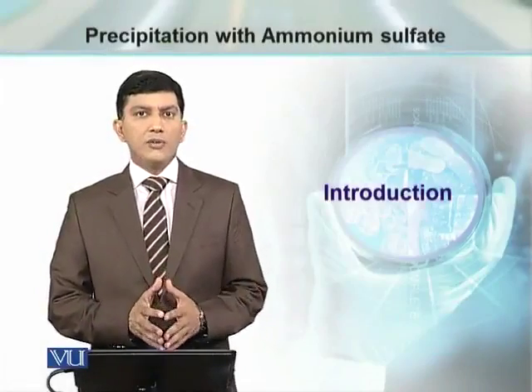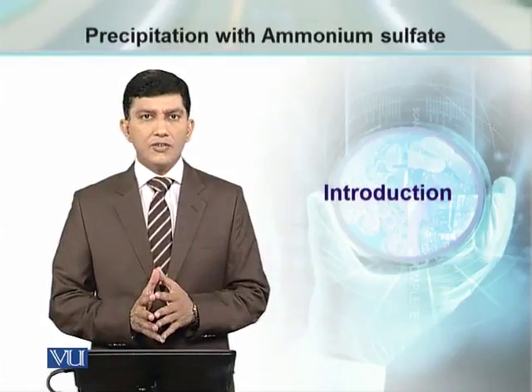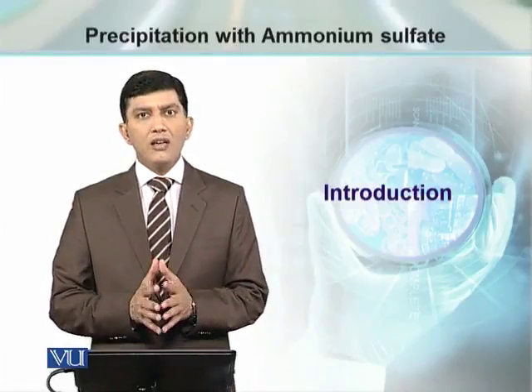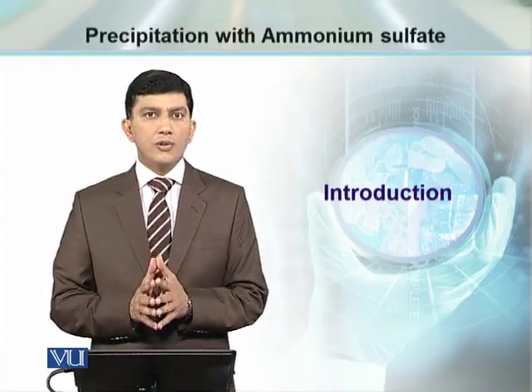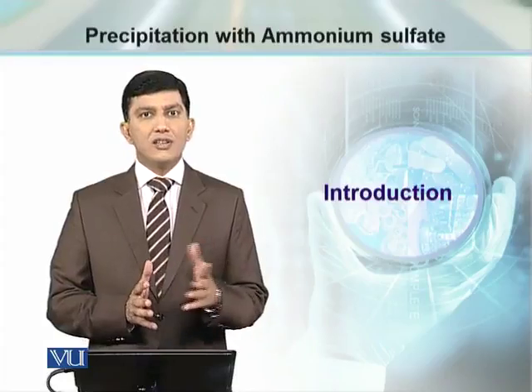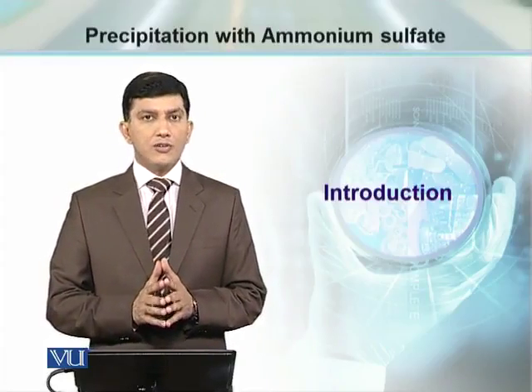प्रोटीन आइसोलेशन के बाद जो नेक्स्ट स्टेप है, उस प्रोटीन को हम यूज़ कर सकते हैं फॉर फर्दर एनालिसिस, और we may need to proceed further for concentration of proteins, means to concentrate the proteins. This is also referred as precipitation of proteins.